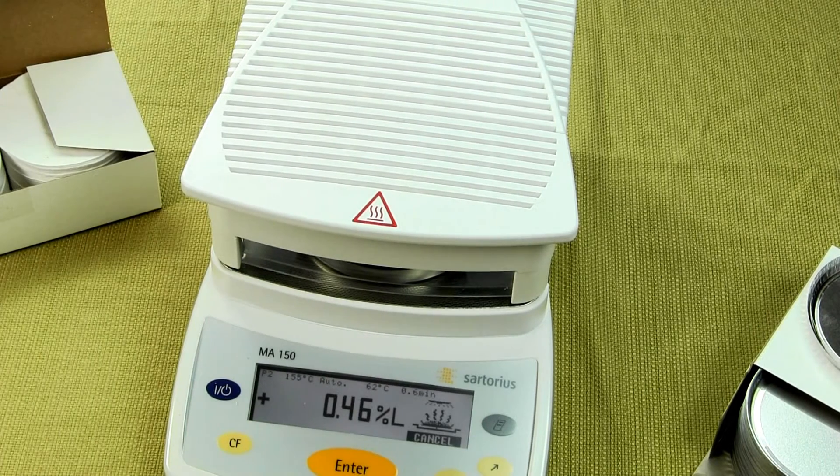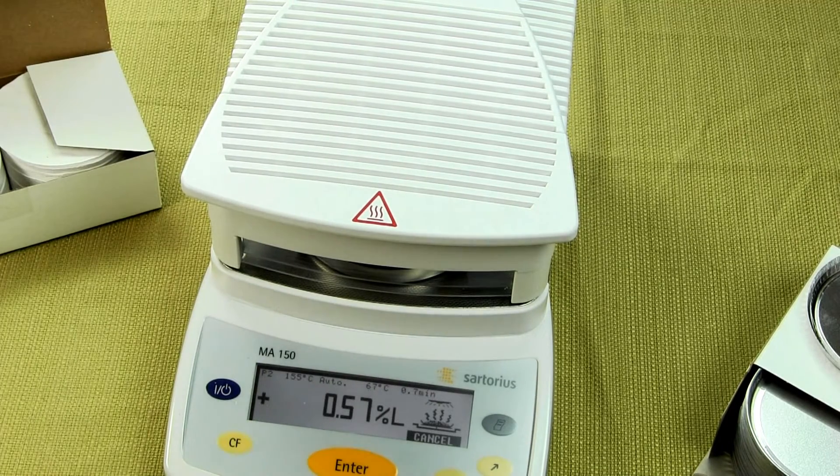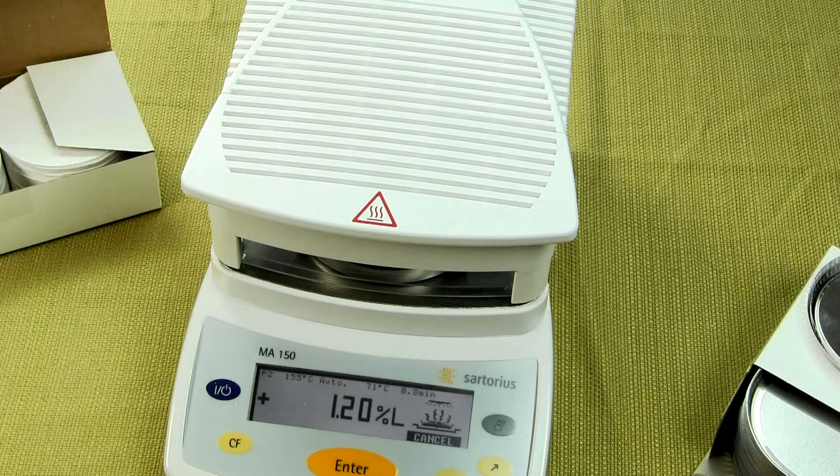The reason why other manufacturers aren't using ceramic is because it's much more costly. Some other specs on the MA-150: the temperature range is from 40 to 180°C and the temperature can increment in 1°C. Many lower-cost models on the market today increment in 5°C. The MA-150 offers 150-gram weighing capacity with 1-milligram resolution, which yields 0.01%. Using a sample from 1 to 5 grams, repeatability will be 0.2%. With a sample size of 5 grams or greater, repeatability increases to 0.05%.